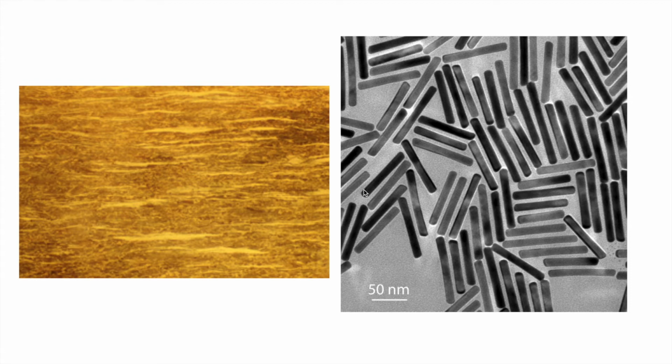And so real materials, if they are a bulk sample, may have some texturing or preferred orientation, or if you have very specific types of growth in certain crystallographic directions, we can have this preferred orientation. And so that's going to affect what we see.